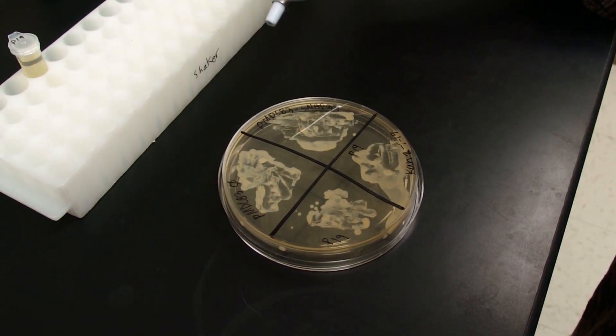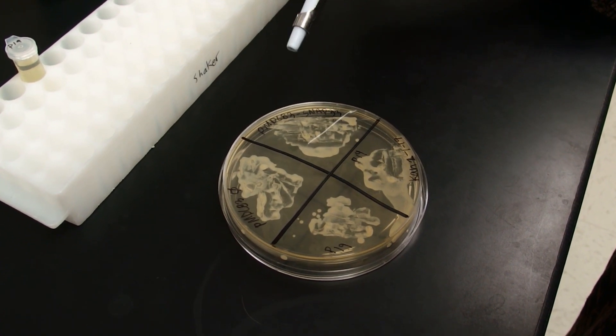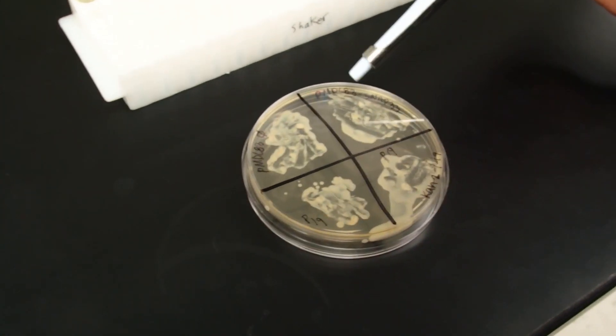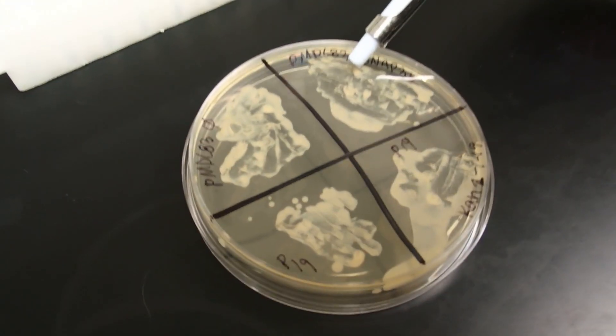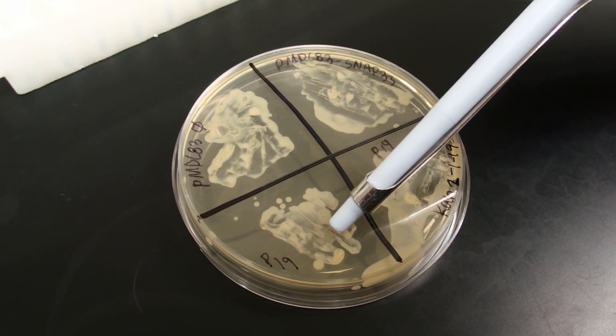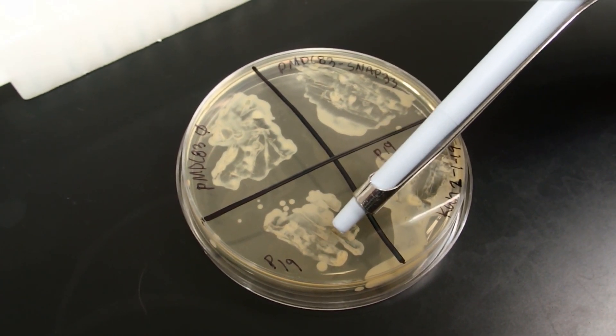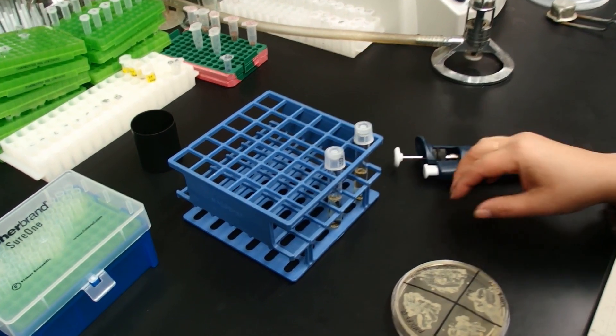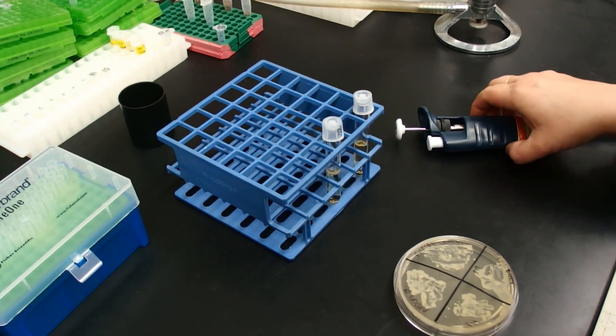I'm going to start the procedure by growing two different agrobacterium cultures. The first one contains the plasmid with my gene of interest. The second culture contains the P19 protein, which is a suppressor of gene silencing. I don't need much bacteria for this procedure, so I'm going to grow just two ml cultures.